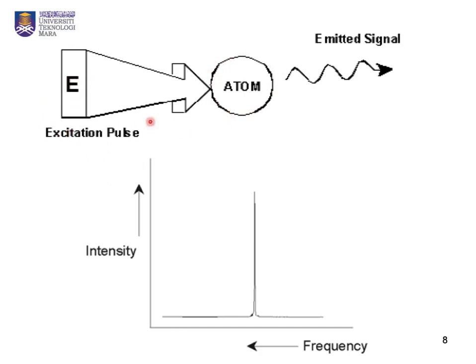When this radio frequency radiation strikes the molecule, the spin of the nuclei occurs, and as a result it emits information about the structure of the molecule, which is recorded in the form of a spectrum, called the nuclear magnetic resonance spectrum.